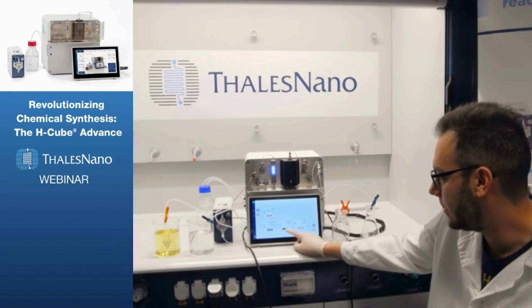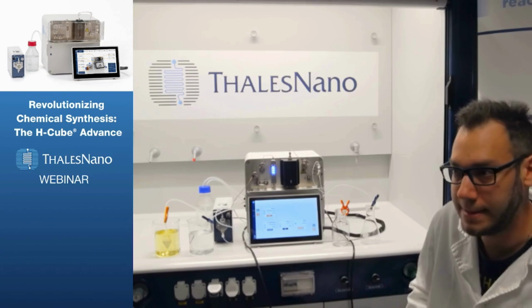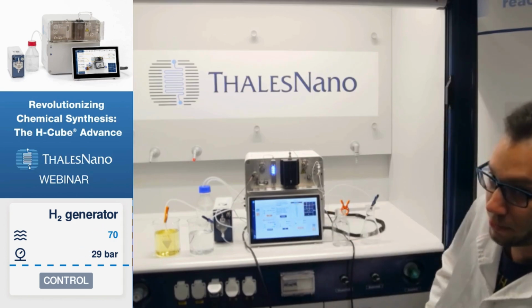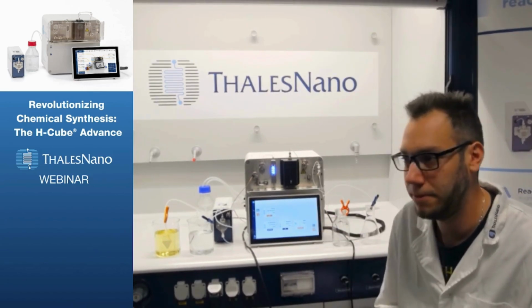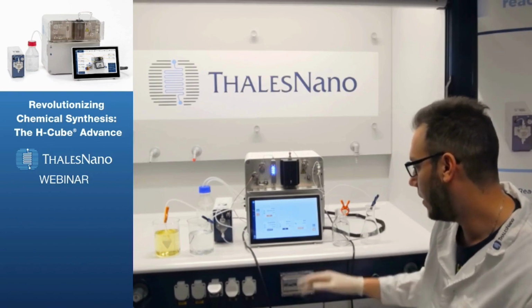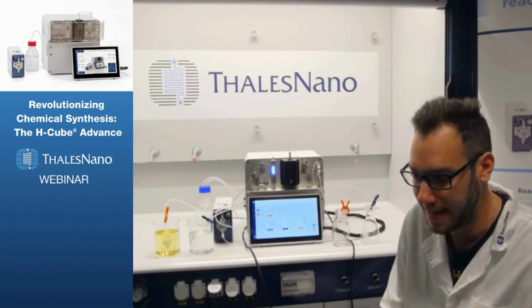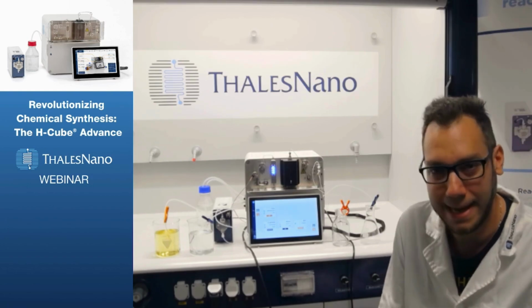Once the heating has been turned on and the 100 degrees has been achieved, the last step that I'm going to take is to press the control button on the hydrogen generation. With internal hydrogen already selected, I'm going to put in 70 milliliters of gas per minute, which is the maximum capacity of the cell. Once the pressure has been built up and the temperature has been reached, I'm going to start the control, or the injection of the gas, as well. This takes a couple of minutes, so we'll come back to you when that happens.